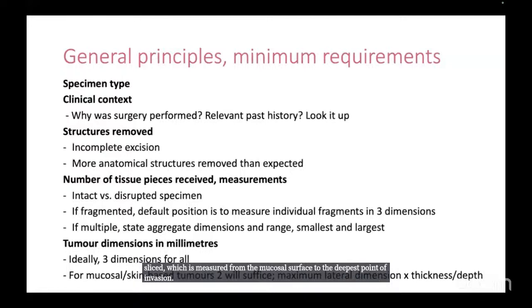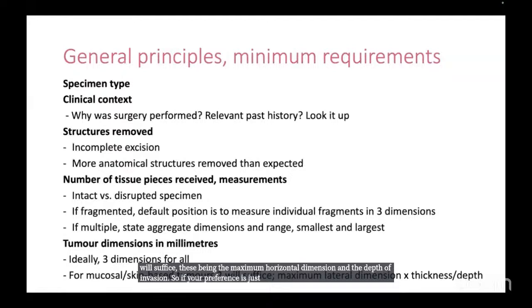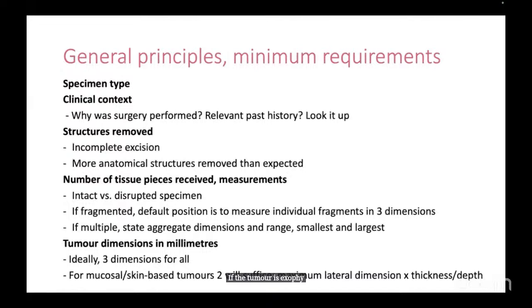Strictly speaking, for staging purposes, 2 measurements will suffice, these being the maximum horizontal dimension and the depth of invasion. So if your preference is just to provide those 2 measures, that's sufficient. If the tumour is exophytic or ulcerated, tumour thickness can be measured in place of depth of invasion.